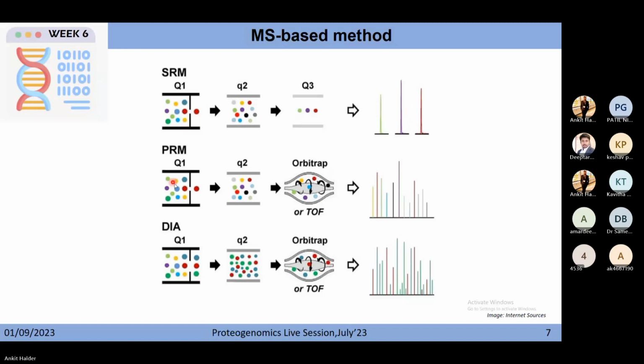That's why an understanding of the concepts related to mass analyzers is needed, for you to better understand how you can design your experiments for different purposes. So now another thing is parallel reaction monitoring. These are all mass spectrometry based methods for validation of those particular proteins.